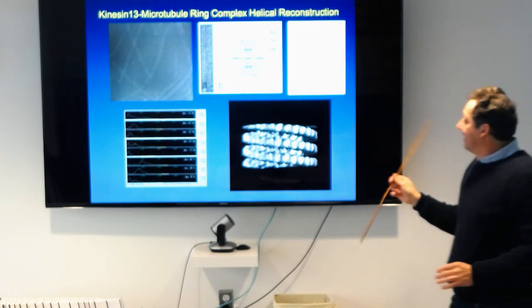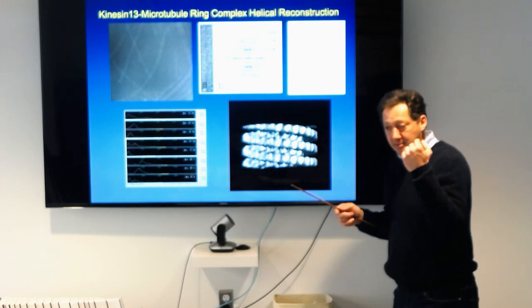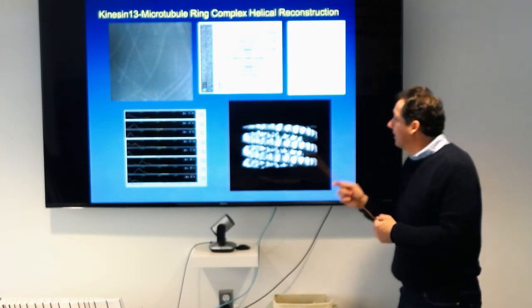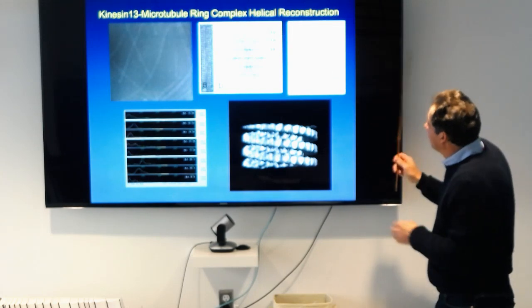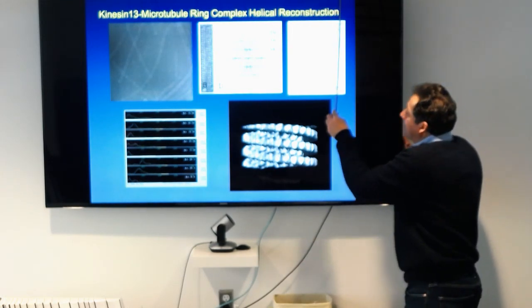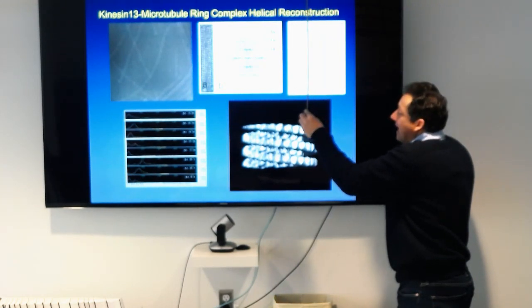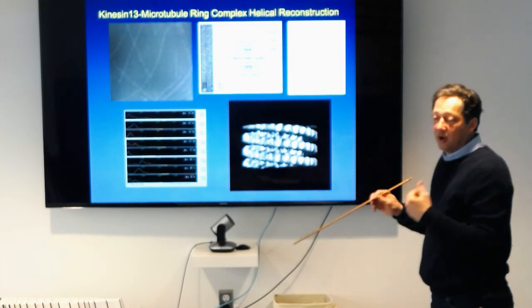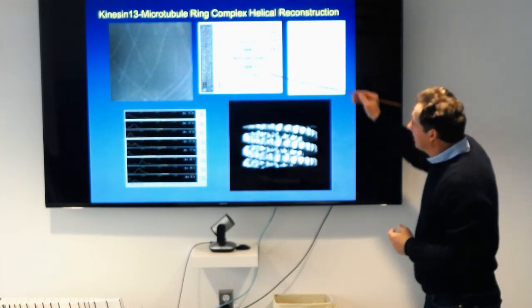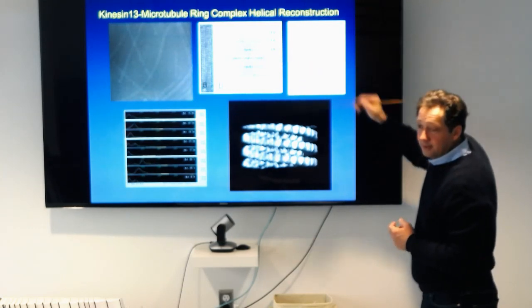One interesting thing is that this is actually the same as the Bessel order. Meaning that, for example, for 15, there is going to be a layer line corresponding to all these planes that is going to have Bessel order 15, which in this case is this one here. Okay?